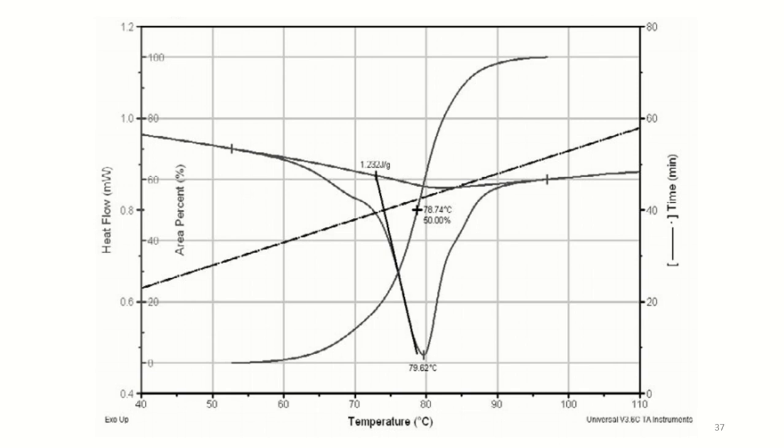A plot of time during the experiment shows that the entire experiment may take only 1 hour or 60 minutes to complete, which is quite a bit faster than typically obtained with microcalorimeters or solution calorimeters.